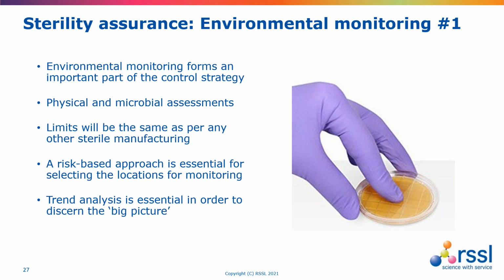And that becomes particularly important if, say, the product needs to be used before a sterility test result is known, because having a thorough understanding of the potential environmental risks is important, and the only meaningful way to do that is through a sufficient number of samples at a sufficient frequency and subjecting that to trend analysis.